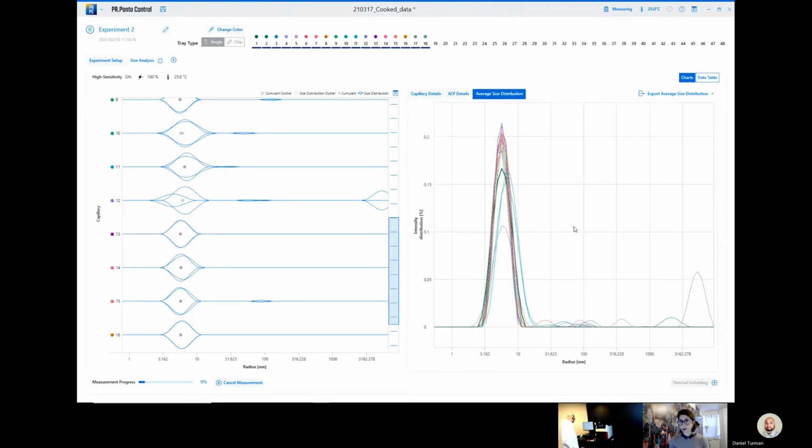So, Leah, if you don't mind, I'm going to switch to data that I've already pulled out of the oven and it's already ready to look at. So it's this exact experimental set that we've already measured. That would be great. Cool.